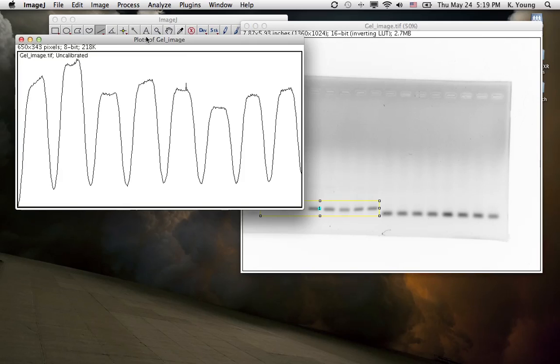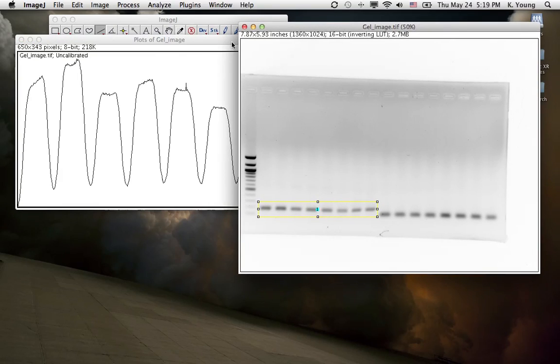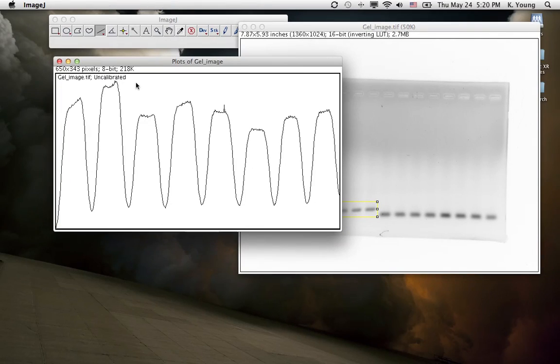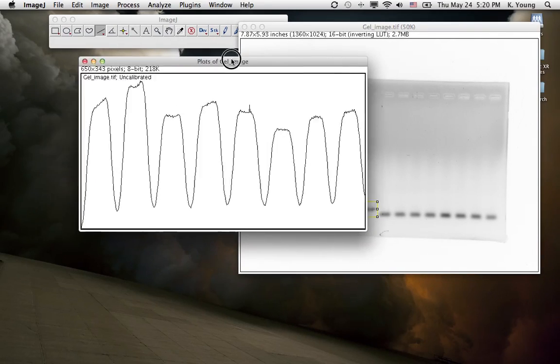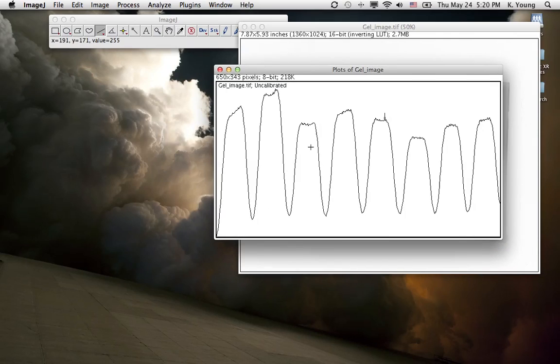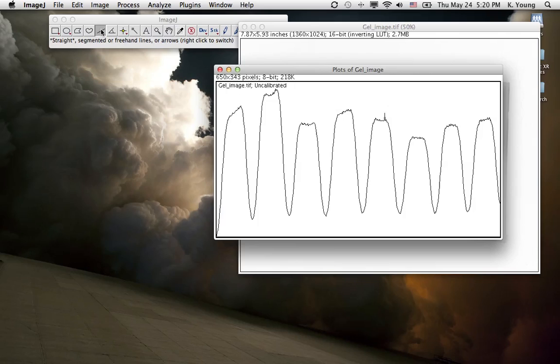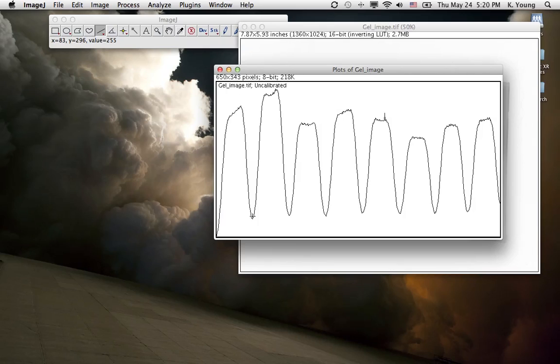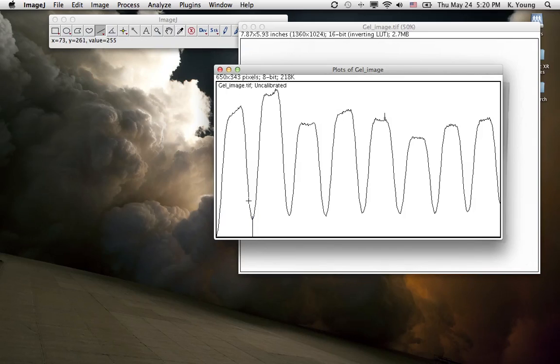So now what we want to do is give this a value. We do that by using this segmented straight free line tool. What we're going to do is isolate each peak. So go like this and make a straight line dividing the first peak from the second peak, trying to be as even as possible.